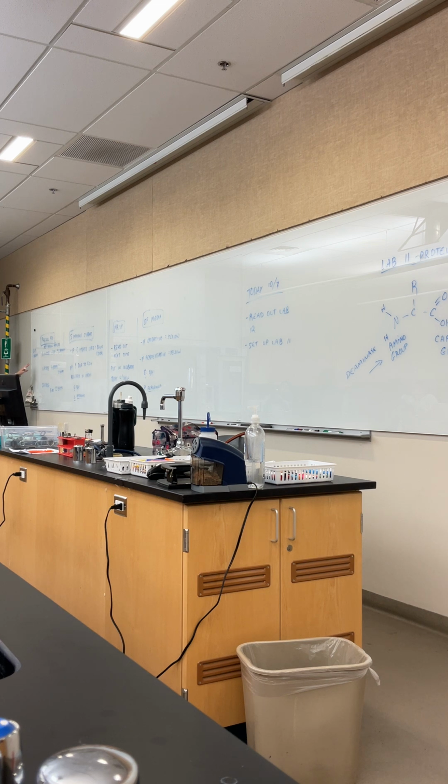So in your book, it asks you to record if you see a gas bubble or not. When you're looking at your media, the Durham tubes are sticking up. I'm looking to see if there's a gas bubble at the top or if there's an obvious gap in my media. Okay, so that's where we're going to start.